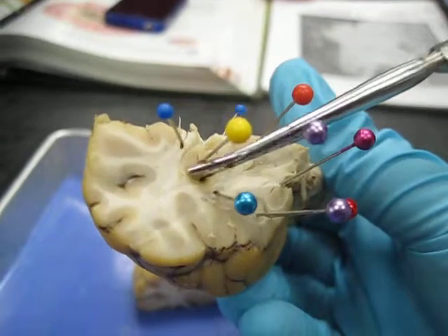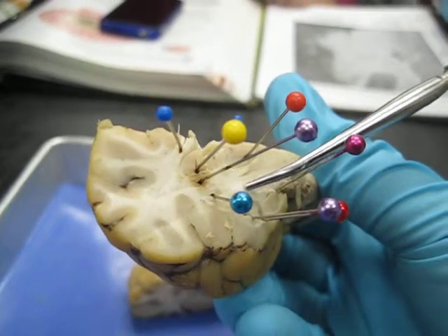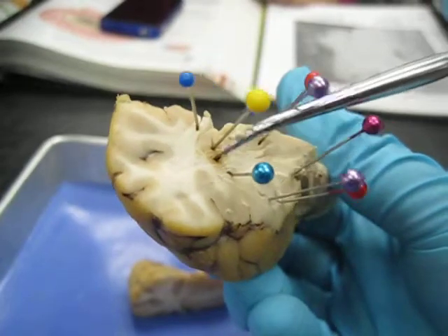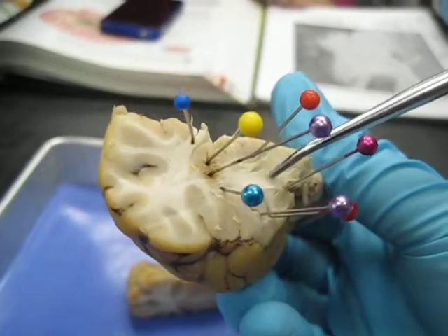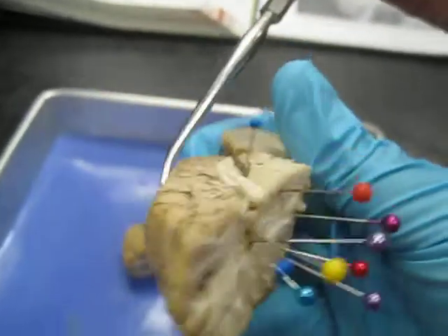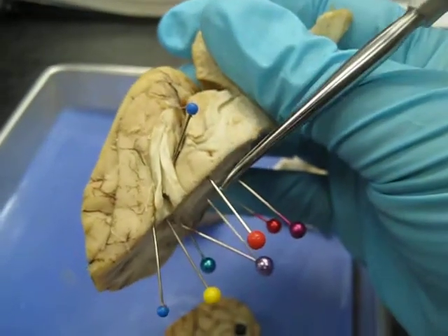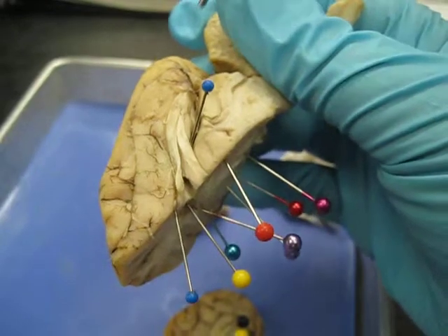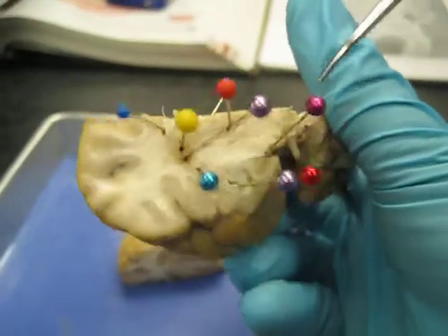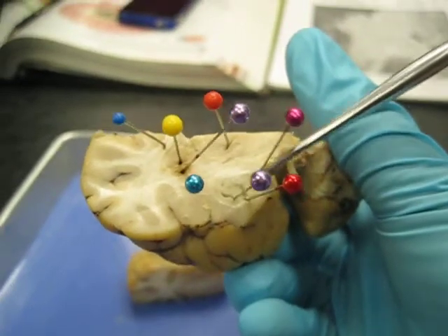So separating those 2, do you know what that white stuff is called? The internal capsule? Yeah, good job. That's the internal capsule, that white area. And then this red pin is just showing, can you flip it this way? It's just showing the thalamus. So this red pin is still the thalamus. So that whole thing, this whole thing.